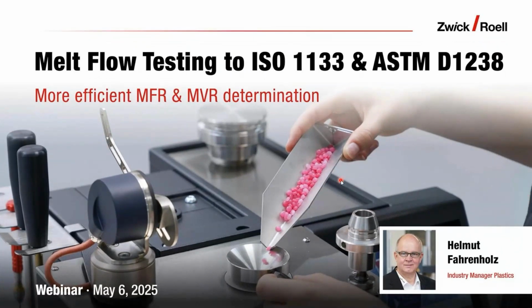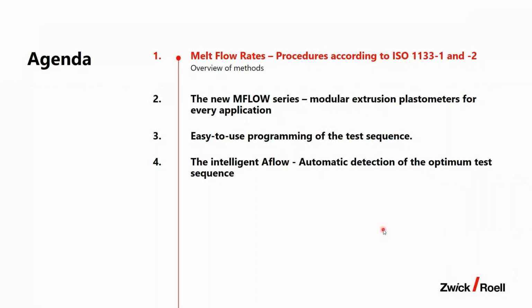And we start into our today's subject. We will talk a little bit about the basics of MFlow testing, the different procedures. This can be quite complicated sometimes. I will present one of our new products, the MFlow series, and the way how you can use this.